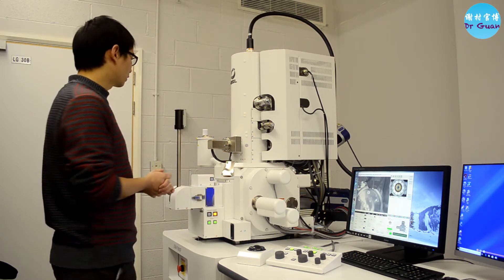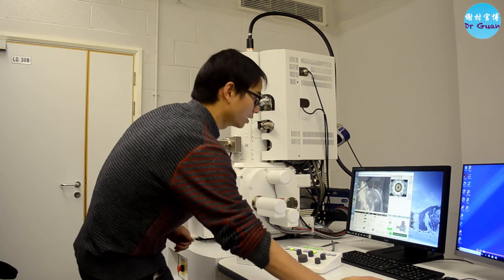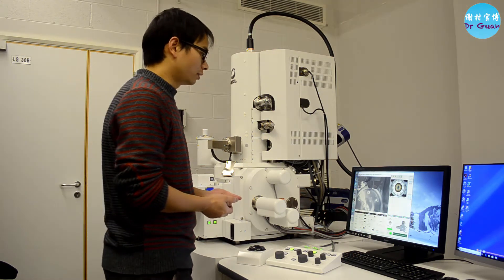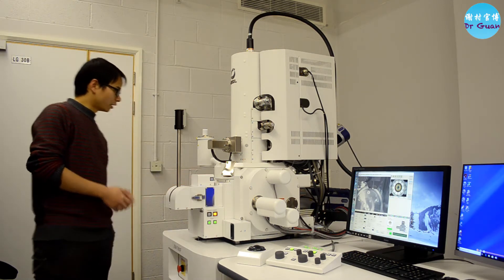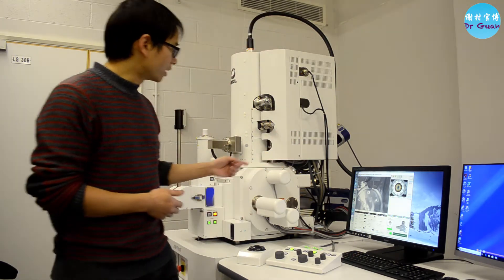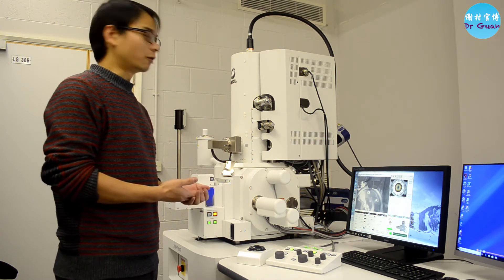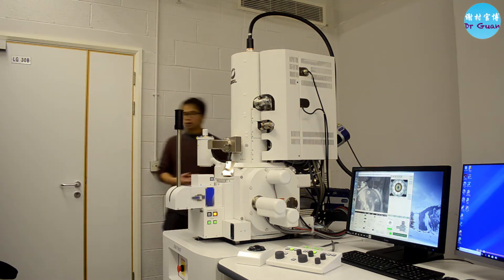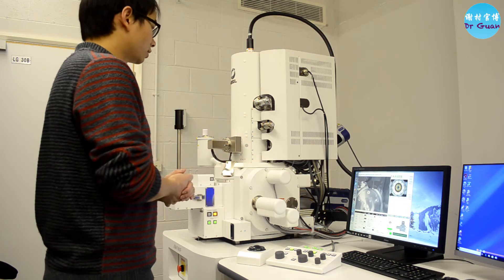We have lots of detectors in this microscope. For example, we have the STEM detector which you can set here. We also have the retractable backscatter detector, which is at the back on this side. We also have the Oxford Instruments Symmetry EBSD detector, which gives very fast, high-speed acquisition — about 3,000 points per second — and we've already tested it and it works perfectly. We also have an EDX detector, so you can do EDX and EBSD simultaneously, making this a very powerful machine.